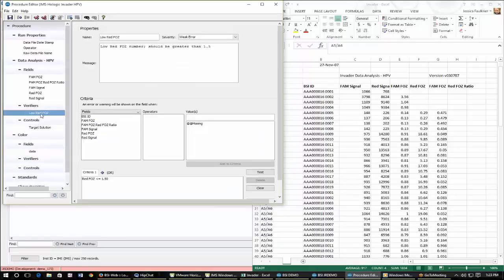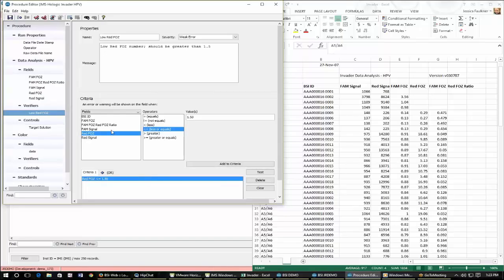And then for the top section, I added a verifier. This is, again, the same as customization or the subject module, where your verifier can be set up based on the fields that you have added. And the one addition here, I don't think this is anywhere else, is the weak error. And this is more serious than a warning, but not quite as severe as an error. So you can save your data if you have a weak error. A regular error, you cannot actually save your data.